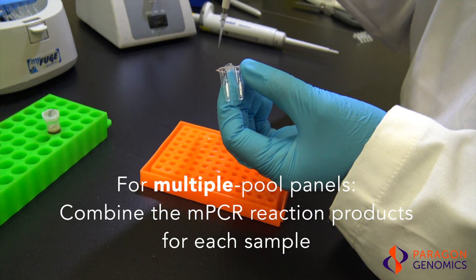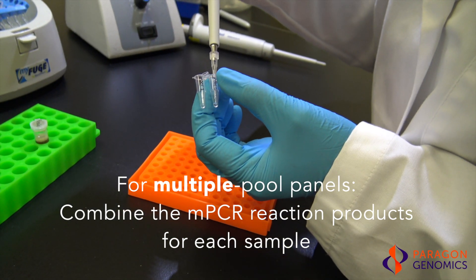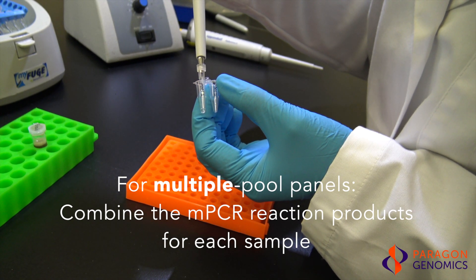For multiple pool panels, combine the multiplex PCR products from the different primer pools in one tube for each sample. Continue with a single tube for the rest of the procedure.